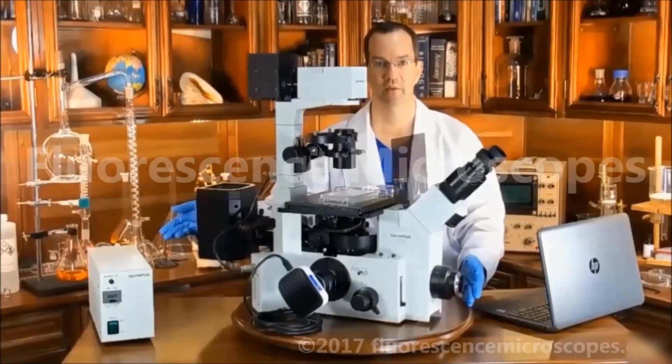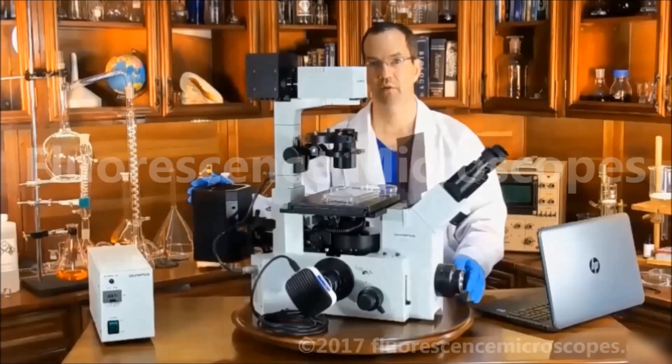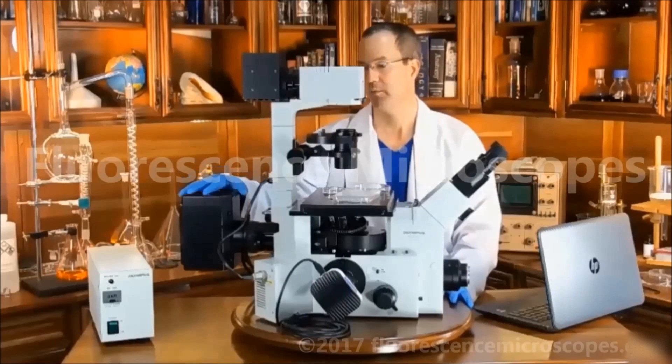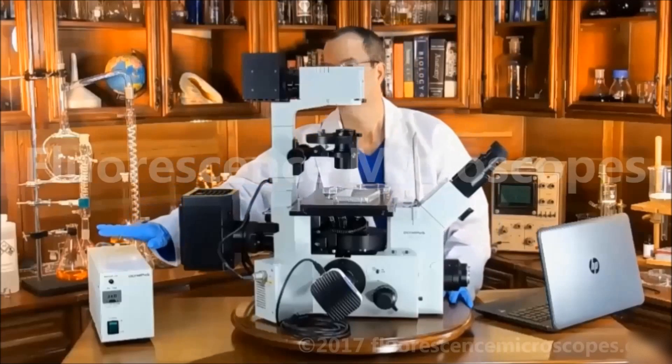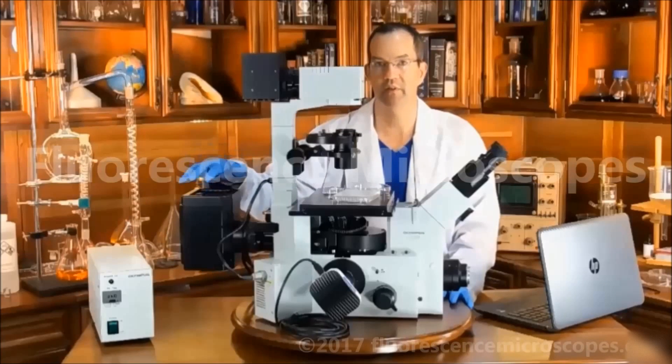This is an Olympus IX-70 Inverted Fluorescence Microscope. We have this unit configured with a 100-watt HPO mercury system. This is the power supply for the mercury. This is the lamp housing with the mercury bulb inside.